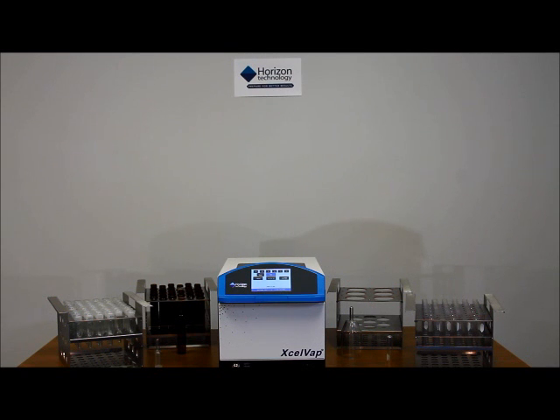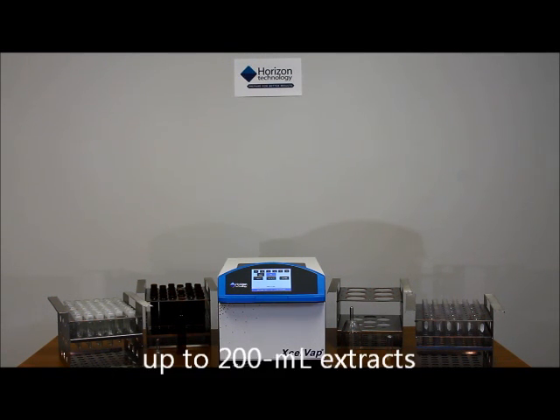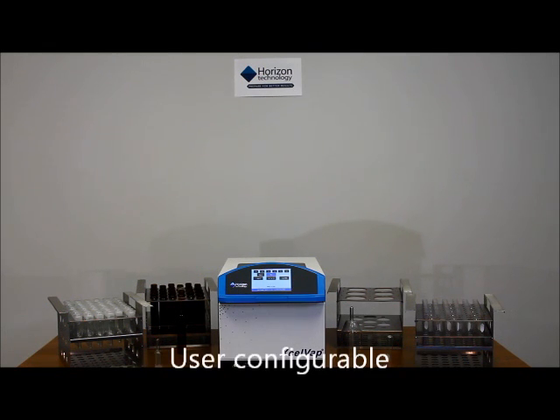It's designed to handle extracts ranging from a few milliliters up to 200 milliliters in a flexible format that can be reconfigured by the user. It can be used as a companion to every chromatograph to ensure the instrument is always supplied with samples and used to its fullest capacity.